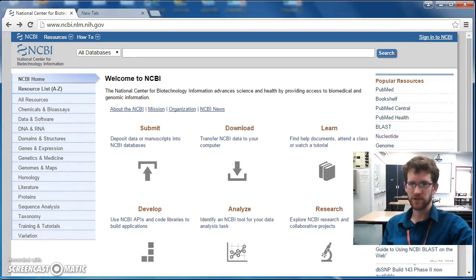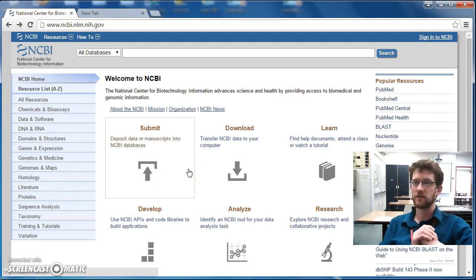Hi, this is Mr. Marcotte, and today we're going to be doing the first part of the Mystery Meat Lab. The first part involves finding a species that you're interested in. It can be any animal, plant species, whatever you'd like, and we can try and get some DNA sequence information about it.